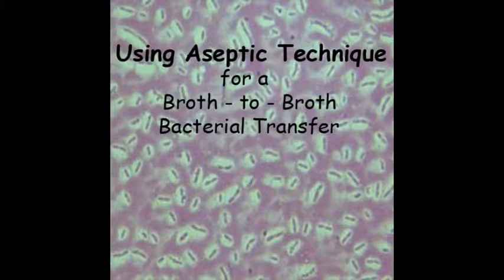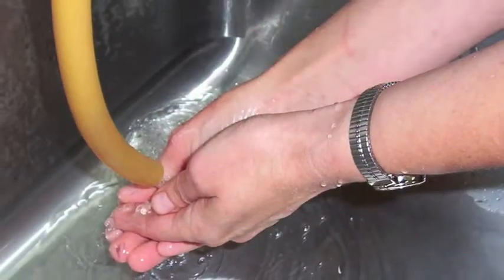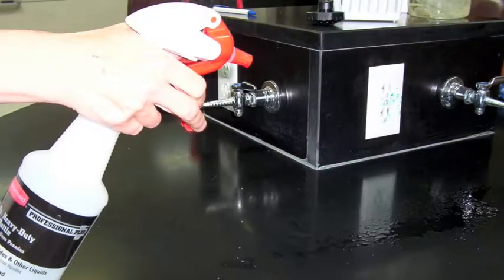Before beginning any project in microbiology, including this one, wash your hands and disinfect your tabletop with alcohol.